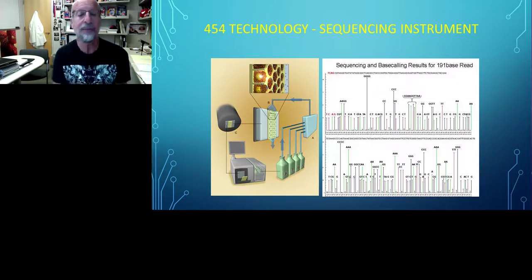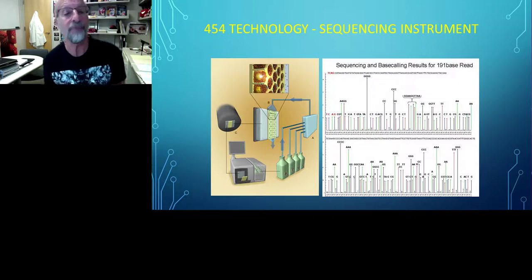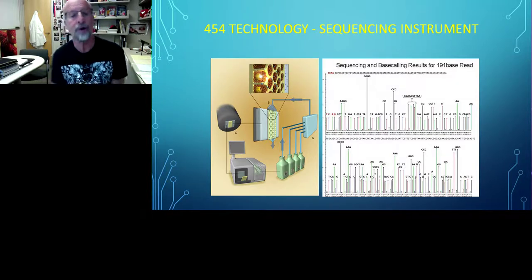If there's a single base, a single A, that will be incorporated. But if there are two A's or two T's or whatever, both will be incorporated and you'll get a slightly larger signal. And you can see this on the top left, if there are 4 G's, you get a signal that's about 4 times the size. This is fine if you're discerning 1, 2, 3, or 4 homopolymers in a row. But if you're sequencing something for a clinical sample, sometimes homopolymers can be 10 or 15 long, and this machine cannot discern the difference between 10 and 11, 12 and 13, etc.